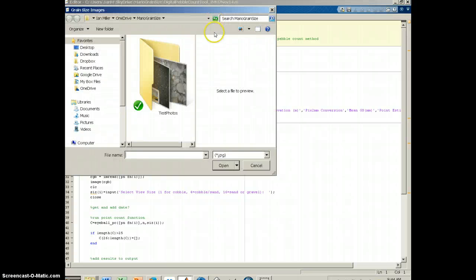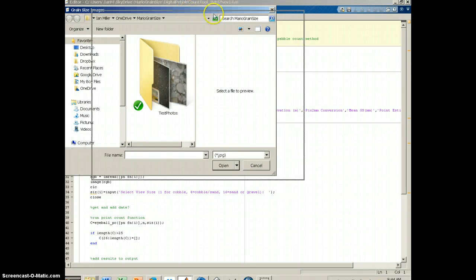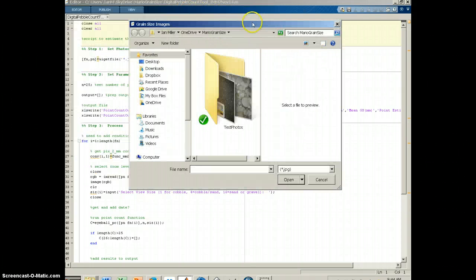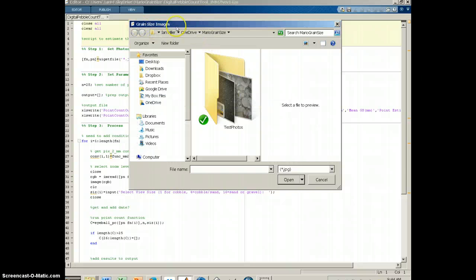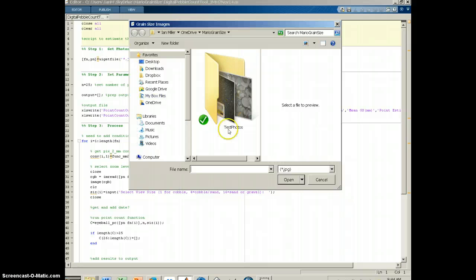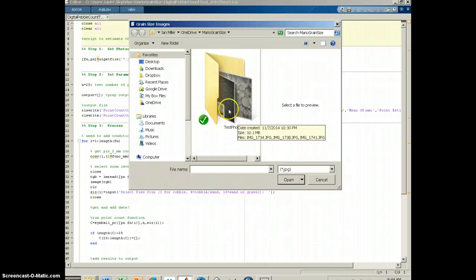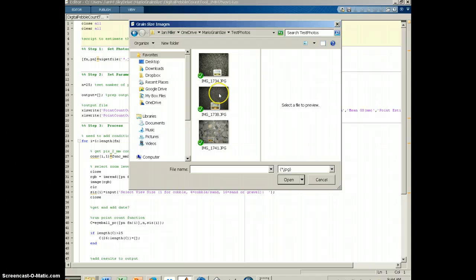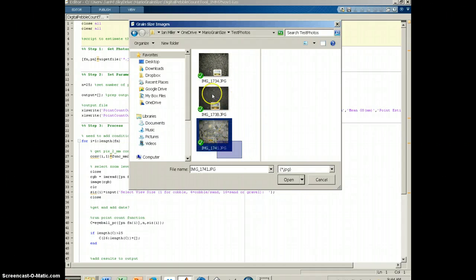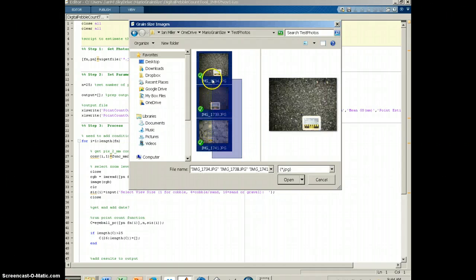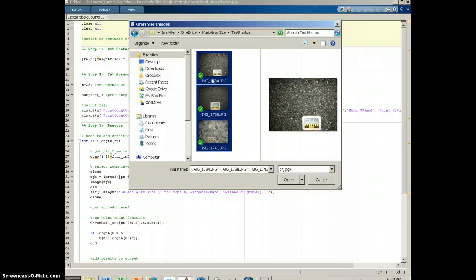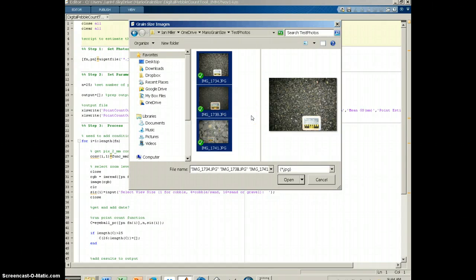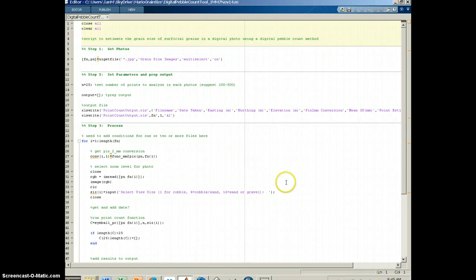When you click run, the first thing that should happen is it should open up a file selection box in which you should see your folder that contains your photos. You need to click on that folder and then select the photos you want to analyze. You have to select more than one, at least two. If you select only one, it's going to give you an error message. So I'm going to select these three and say open.